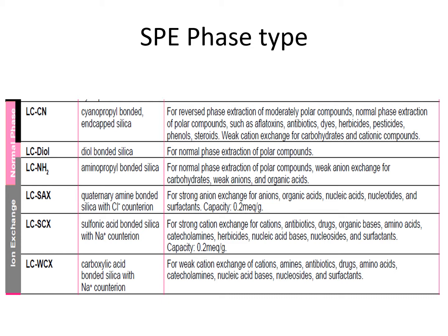Okay, so probably we can use this type of SPE cartridge. When we want to choose the SPE cartridge, basically we have to choose whether it's reverse phase, normal phase, or ion exchange. It is based on the property of the analyte, whether the analyte is polar, non-polar, or a neutral compound. But in most cases we will use the reverse phase under normal conditions. Again, it depends on the type of analyte that we are going to use.